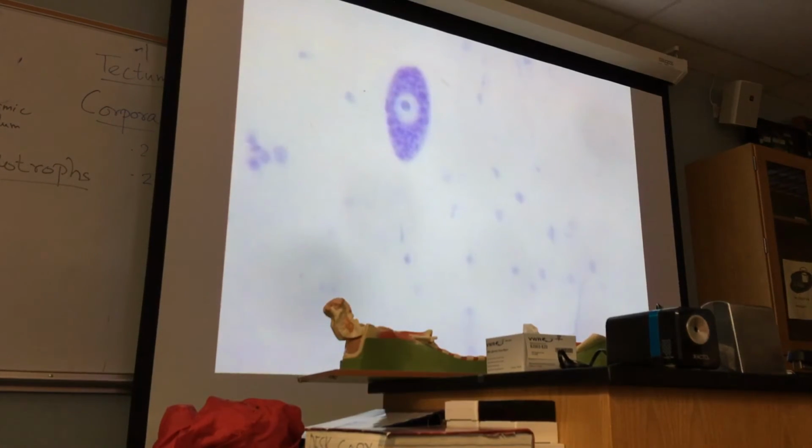Do you have any question? So this is a specially prepared slide. And this special preparation was for identifying the structures containing RNA. And we know that rough endoplasmic reticulum has ribosomes, and ribosomes are made of RNA. What kind of RNA?